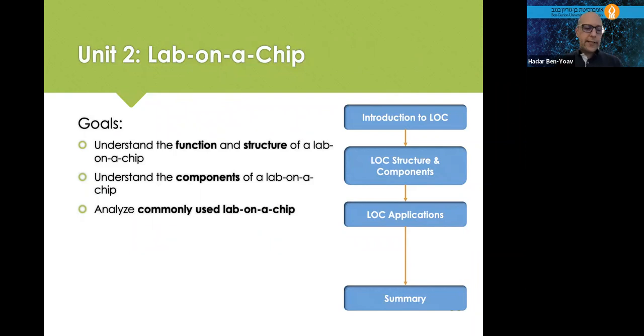So with that, I'm finishing lecture number two, which focused on lab on a chip. The goal was to understand what a lab on a chip is, what the structural configuration is, what defines a lab on a chip, what categories of lab on a chip we have, the components, pre-treatment steps, the sensors. I wanted to show you as many examples as I can of commonly used lab on a chip devices, and break them down into what is the sample, how it's being treated, what the sensors are, and what the output signal is.